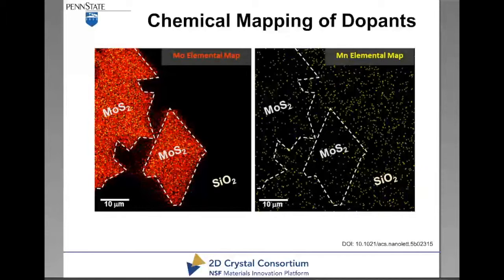So I think one of the last things I really wanted to talk about was atomic scale electronic properties. And this is with STM, STS. It was a 1986 Nobel Prize where you take the STM tip, a metal tip that's atomically sharp. So these are individual atoms in the red. We have our sample at the bottom, which is green here, and you put a voltage across them.